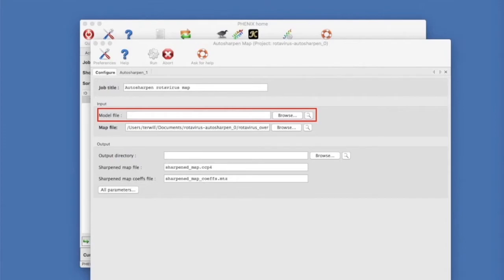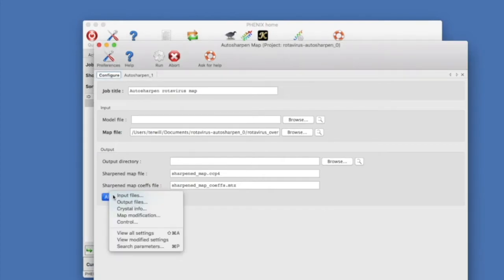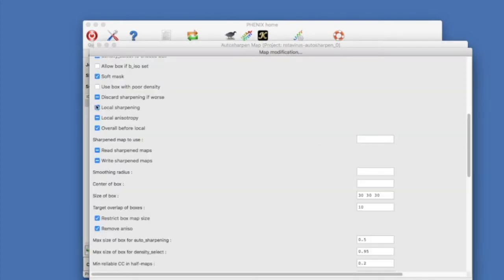You can also use auto sharpen to sharpen locally with a different value in different parts of the map. To do this, go to all parameters in the auto sharpen window, then click on map modification and turn on local sharpening.